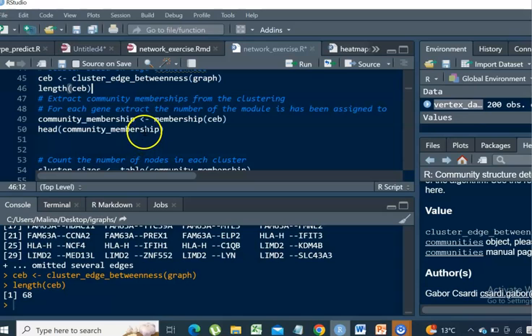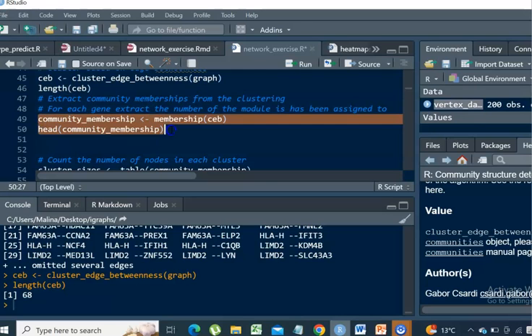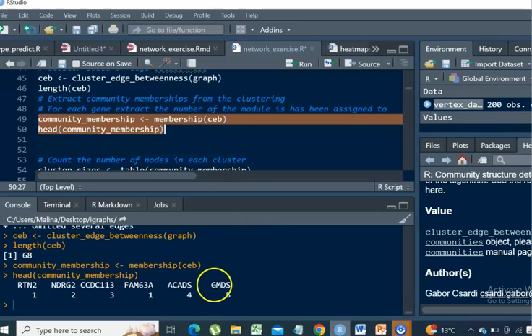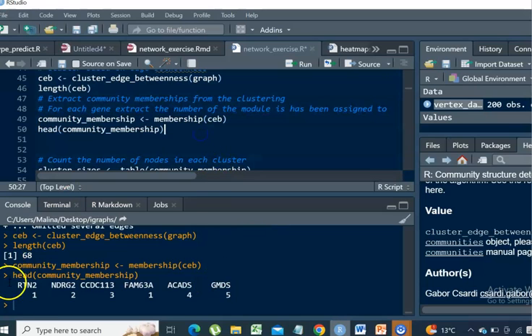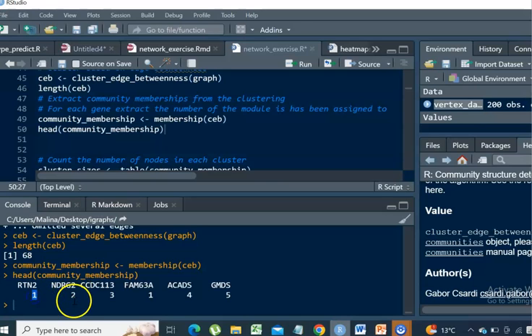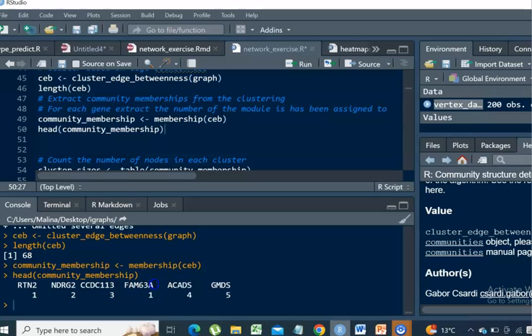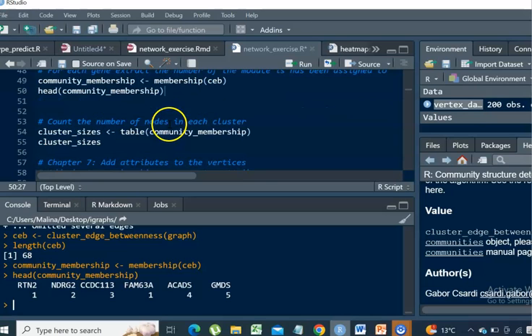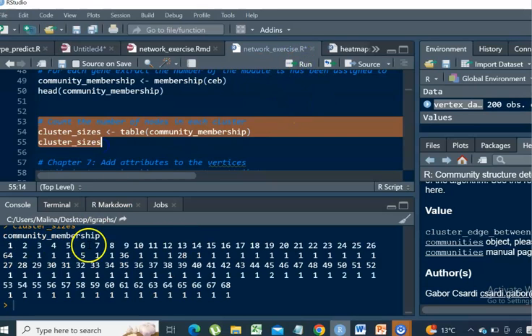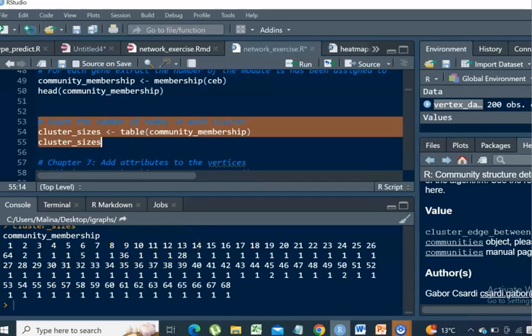It's just showing the total number of the local communities. What we can do next is to obtain the community membership for each of our genes. For example, RTN2 belongs to community 1, NDRG2 belongs to community 2, CCDC113 belongs to community 3, FAM63A belongs to community 1. So you can see that the first gene and the fourth gene belong to the same community. We can quickly have an estimate of the sizes. Community 1, 9, and 15 are the largest.